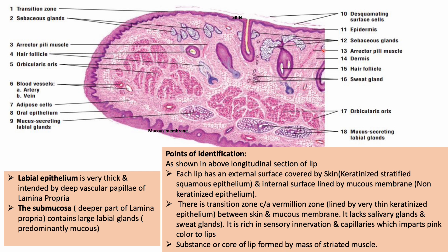The outer hairy skin consists of keratinized epithelium. You can see this dark area is the epidermis, and within the epidermis you can see a hair follicle — all the features of the skin are present here. In the dermis you can see sebaceous glands, the rectus pilae muscle, and sweat glands — all the typical features of skin.